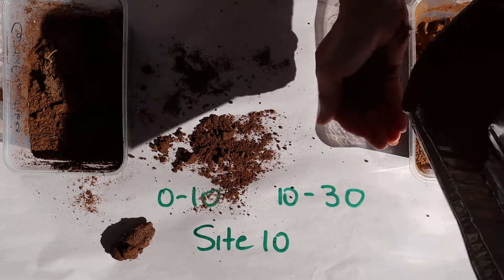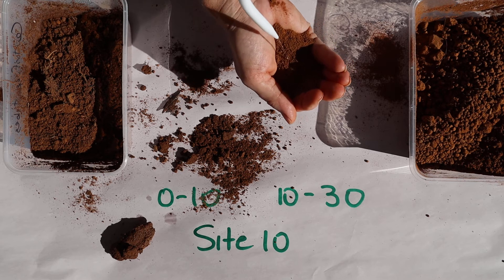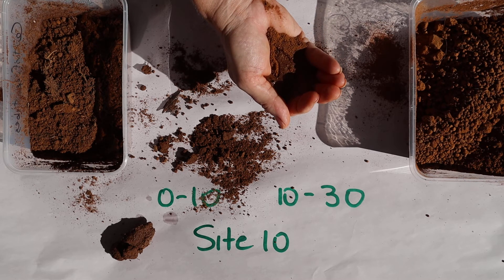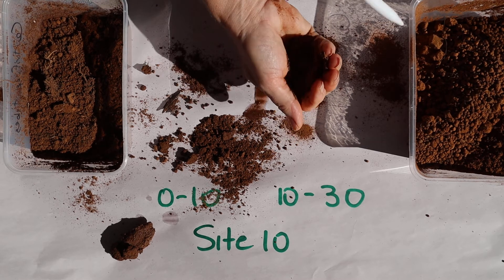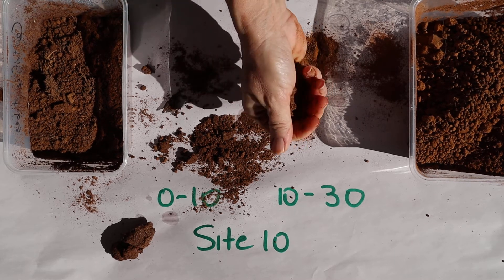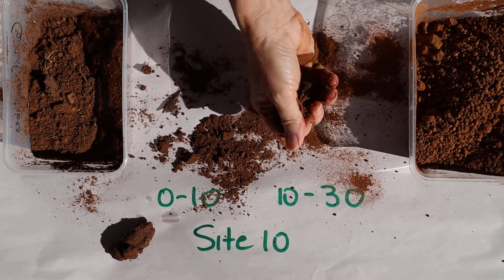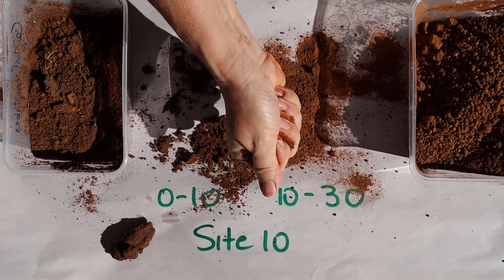Again, I sieved this soil off camera. It doesn't really want to soak the water up — that'll be interesting when we come to the water repellency test.